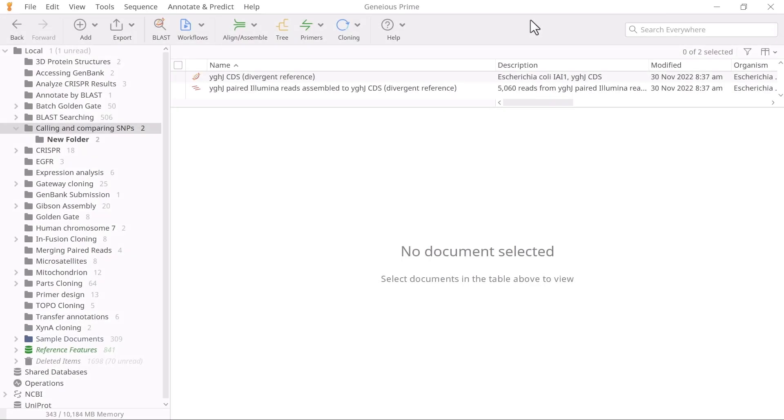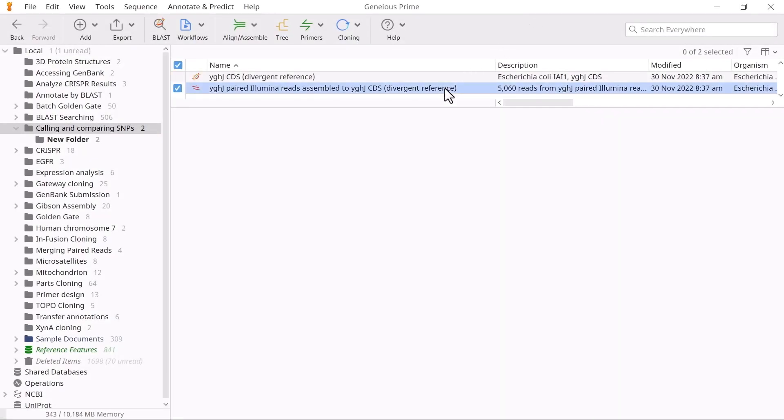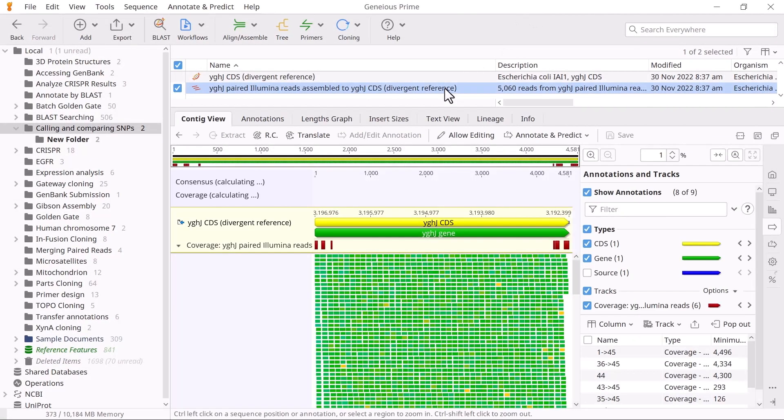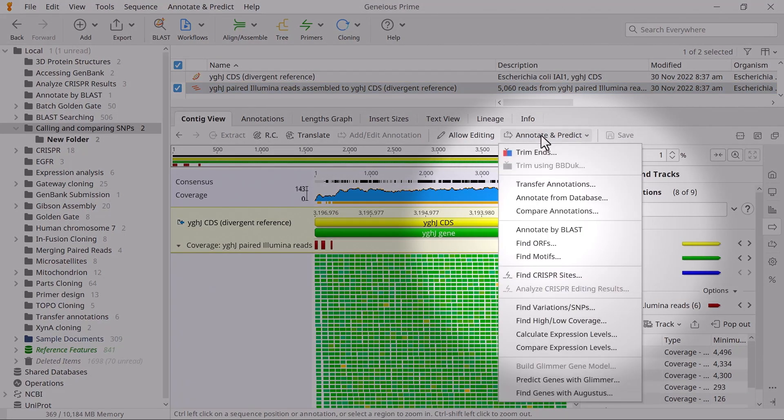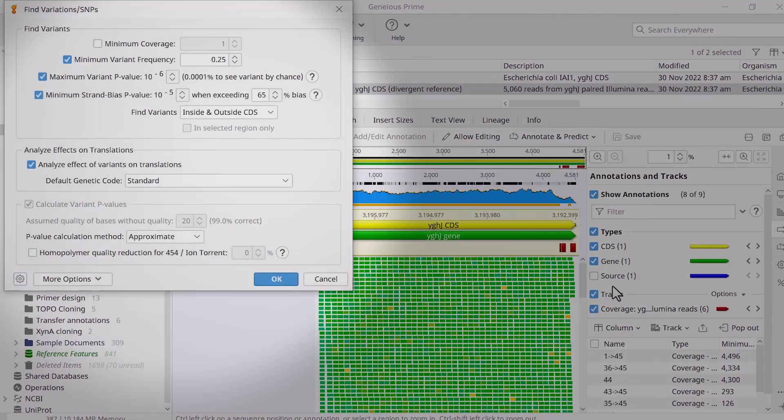To find SNPs in the mapped data, select the CONTIG file and go to Annotate and Predict, then Find Variations slash SNPs.